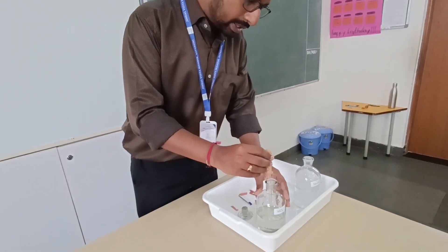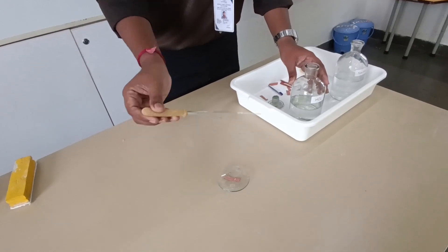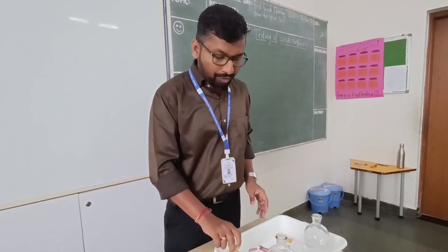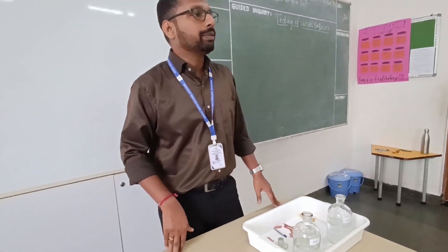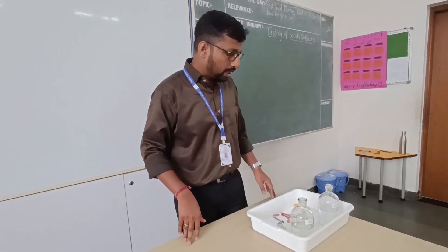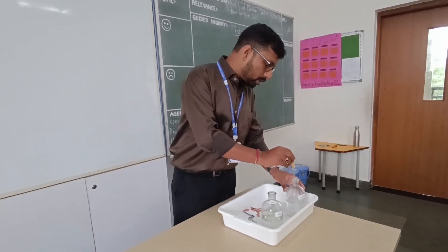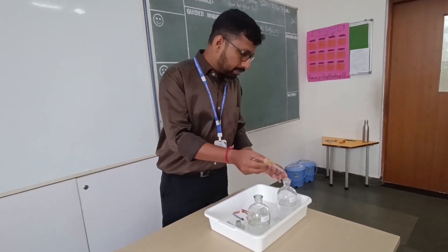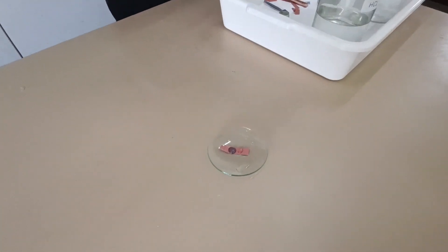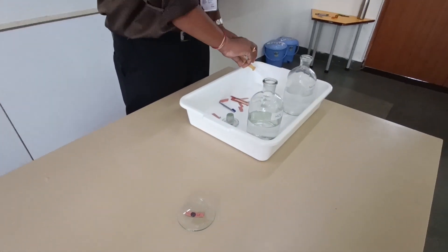What should happen if I drop a drop of acid on the red litmus paper? It should not change the color. And what if I put sodium hydroxide onto the red litmus paper? What should happen? It will turn blue. Has it changed the color? Yes — very good!